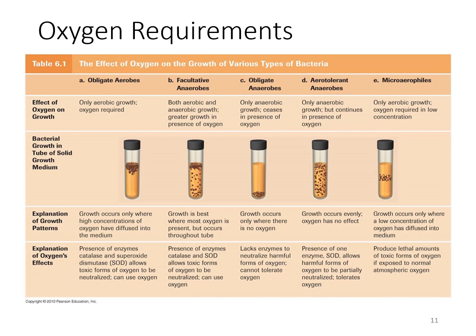To inoculate these types of tubes, you would take a needle or the culture loop, and you would inoculate the top of that agar, and then you would stab down into the bottom of the agar to make sure that the specimen passes not only the top but all the way through the agar to the bottom. With the culture being presented to the bottom of the agar, you are allowing any sort of anaerobic growth to take place without the presence of oxygen.